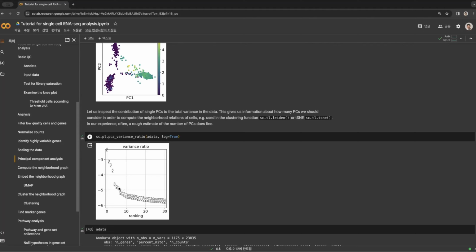And PC7 and 8 a lot, but PC8 and 9 is not as great as PC7 and 8. Then you can see that the deviation between the nearby pieces is getting lower and lower, right? So up to this point, they cannot explain that much, right?